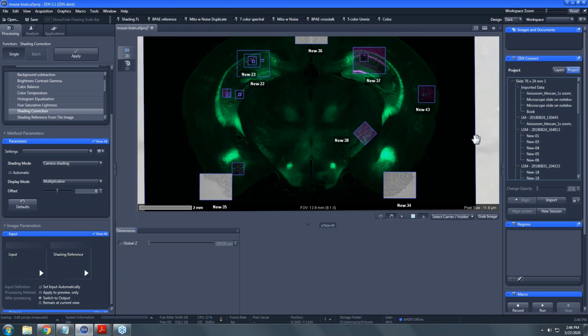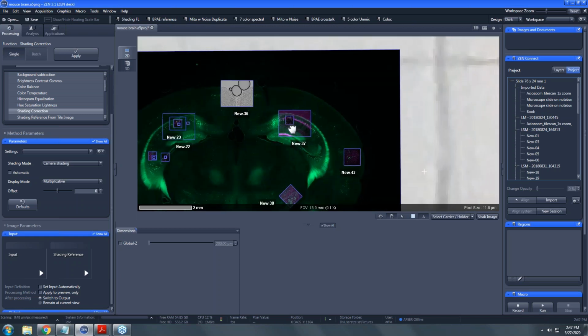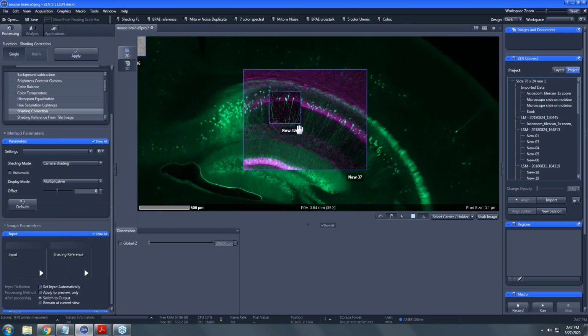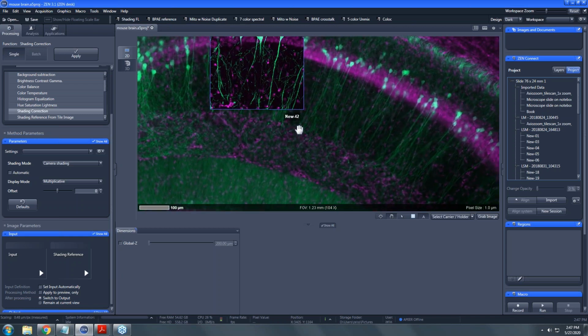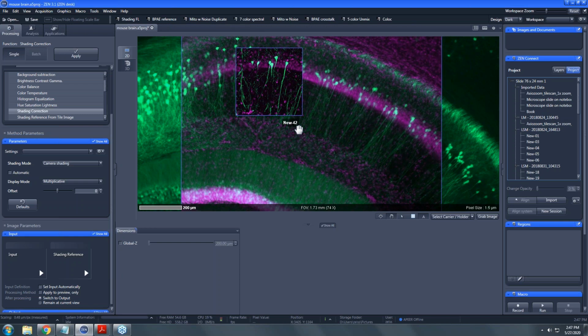It's not my data set though, so I'm pretty sure that's not. And then that whole brain coronal section that we have here, we have smaller images overlaid that are from a laser scanning confocal. And then the even smaller images, we've run that LSM in a super resolution mode, and those are overlaid as well. So you're zooming in and in, you always get the context of what's going on here.